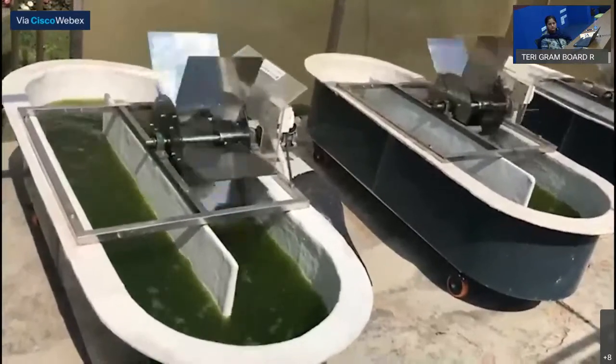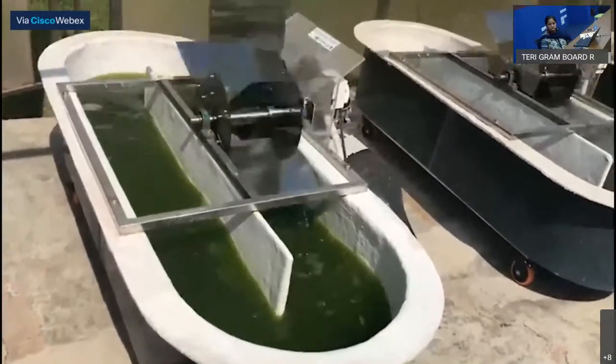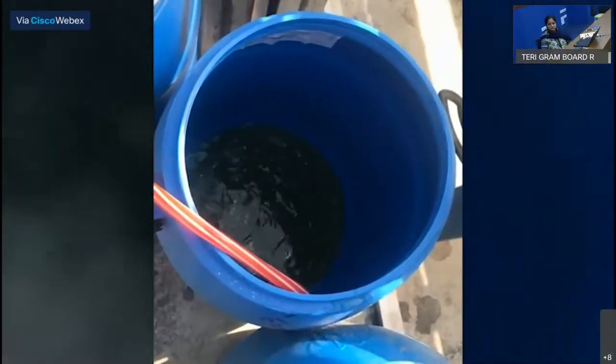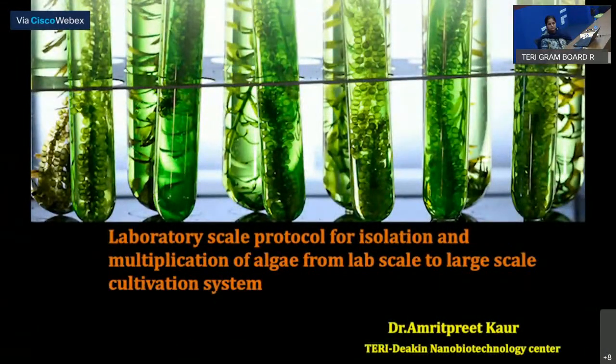and the optical density and pH are continuously monitored on a daily basis. We need to make sure the OD does not go below 0.2 in order to prevent the cultures from dying. At different phases, exponential and stationary, the cultures are harvested and flocculants are added to the harvested material. After overnight settling, the culture from the bottom is concentrated and harvested for further use in characterization of biomass for lipids, protein and other bioactive molecules.